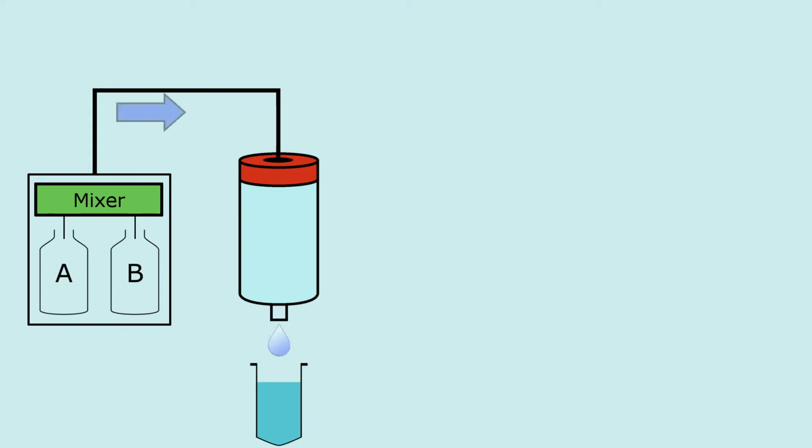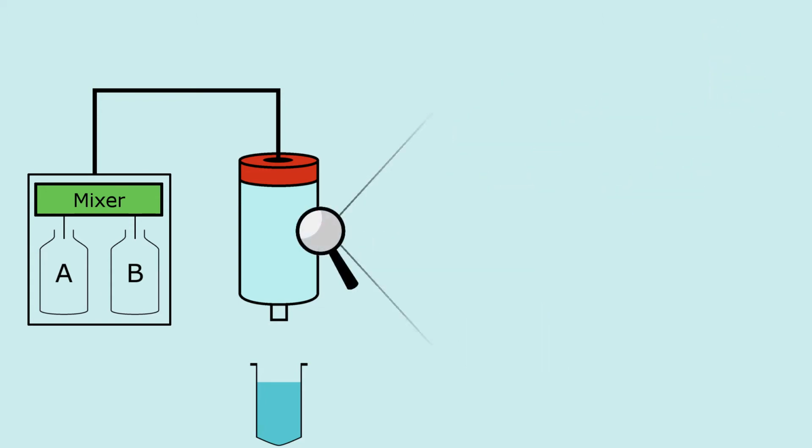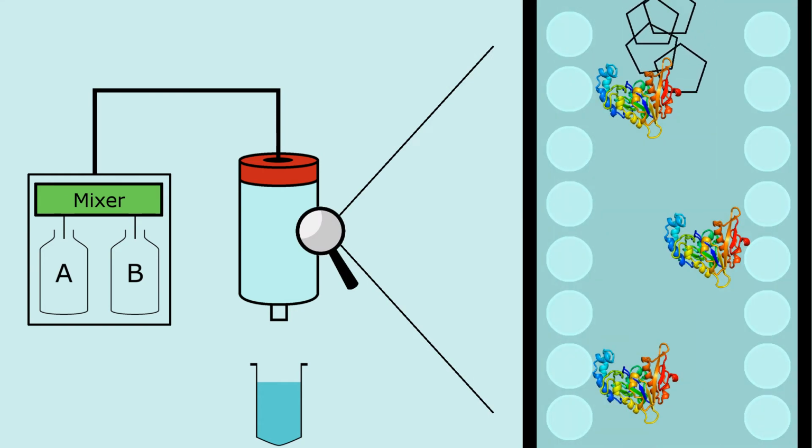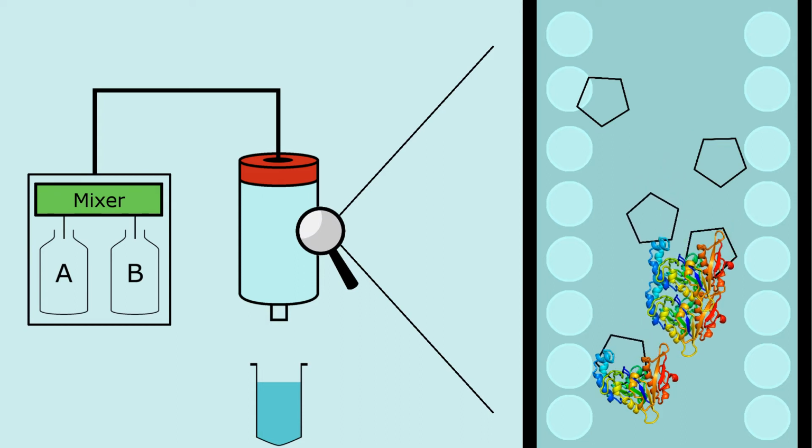Now we have reached the actual purification step. Here we release the protein from our column and collect its contents in a process called elution. Comparing the structure of histidine to imidazole, you can see the two are very similar and both bind very well to nickel. Because of this, introducing imidazole to the column competitively binds to the nickel ligands, releasing the previously bound proteins.